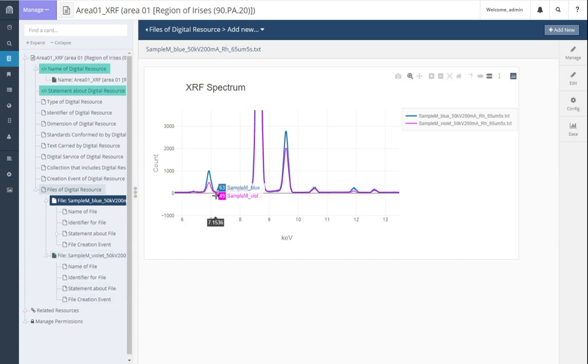One of the other things that's really compelling about this to me is it also makes it much easier to share this information. So you see here at the top, there's a specific URL associated with this page, this part of the Arches for Science system where this data has been uploaded. So if I wanted to, I could simply copy out that URL, email it to a colleague who has access to the Arches instance that we're using, and have them take a look at the data.